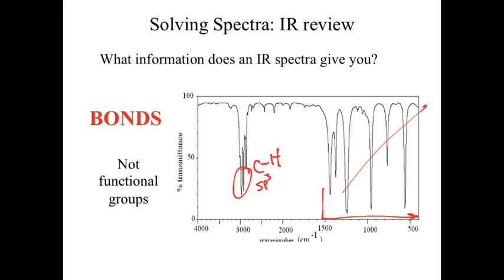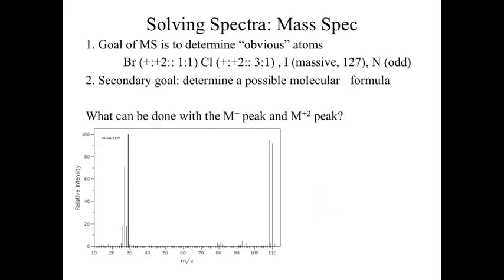Okay, so mass spec. This is an example spectrum for a particular compound that we are going to evaluate. So remember what mass spec is. This is a horrible, completely non-politically correct analogy, but say we had a car, and that's my best representation of a car, and somebody put a bomb in that.